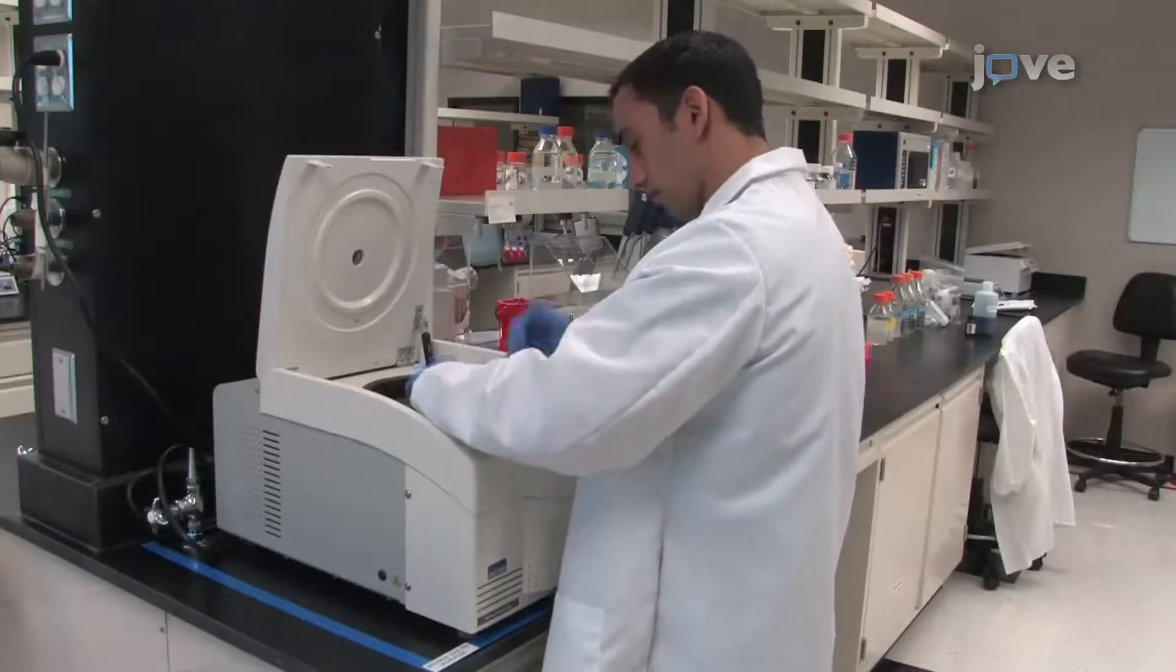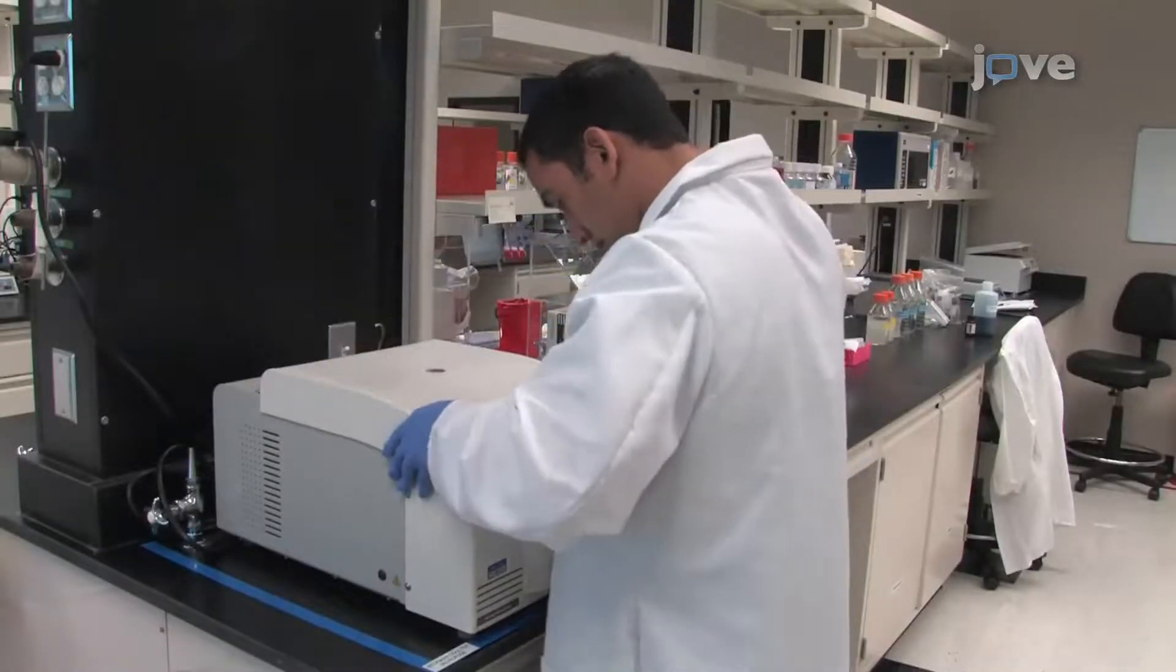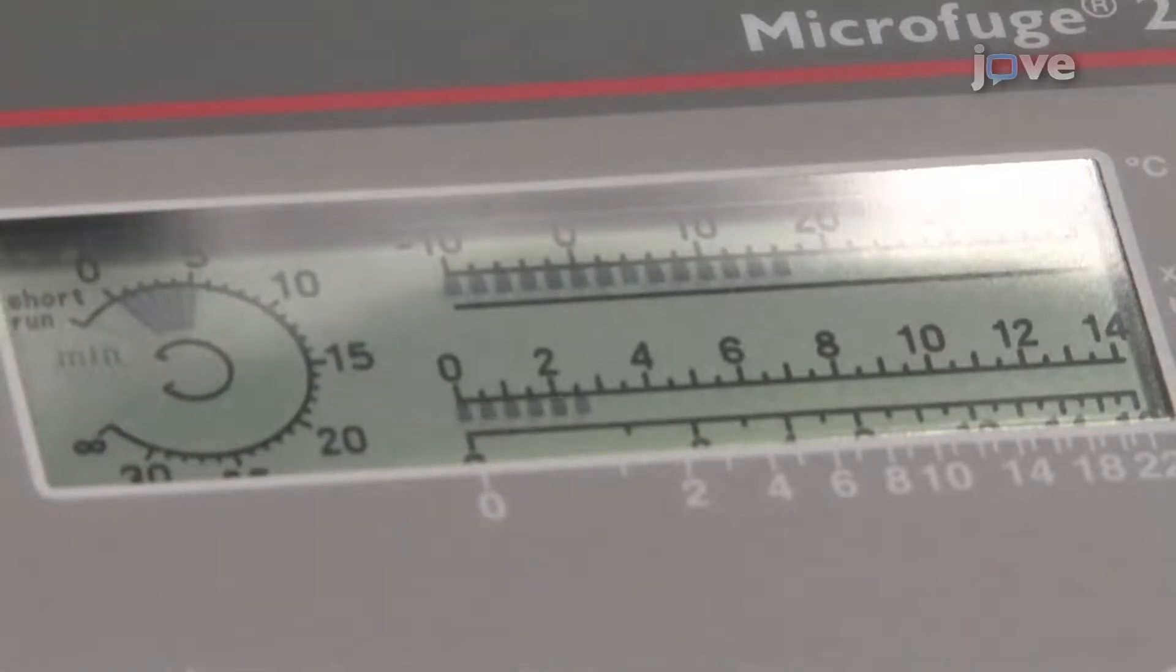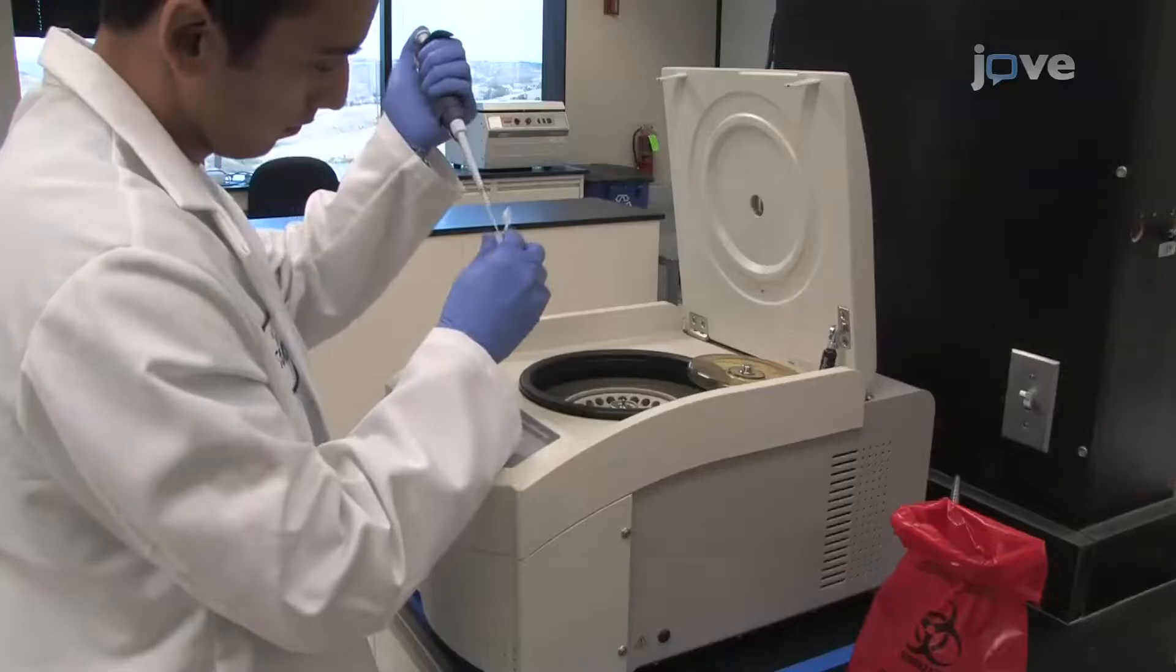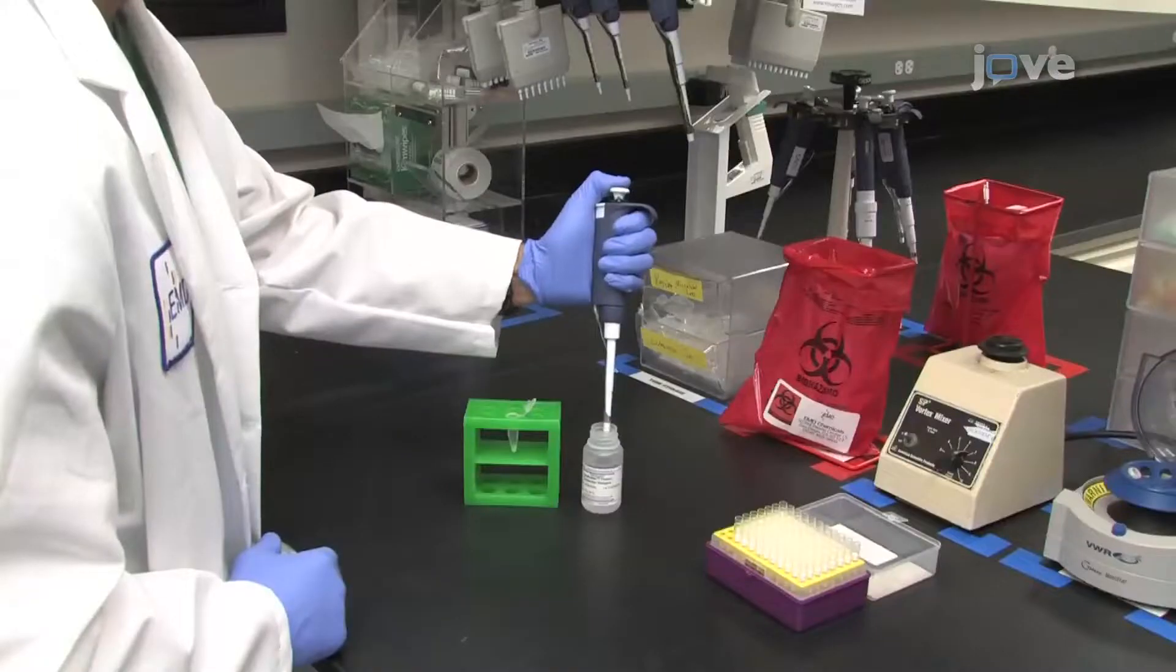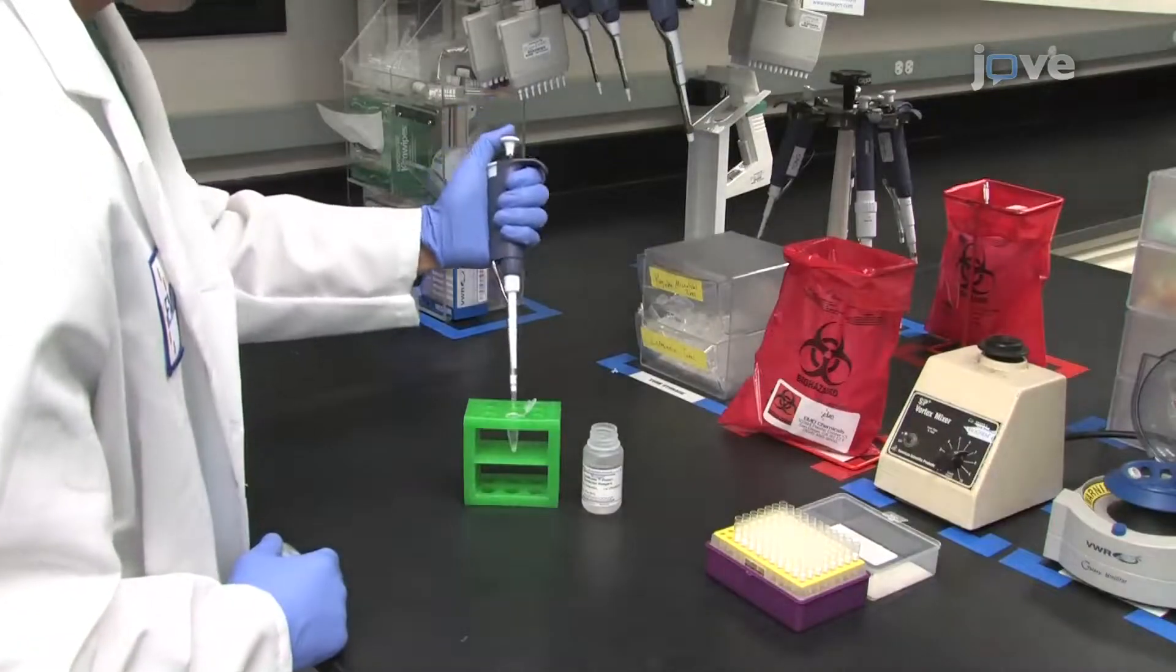The first step in Western blotting is sample preparation. Begin sample preparation by pelleting the cells using low-speed centrifugation, such as five minutes at 2500 times gravity. Following centrifugation, drain the cell pellets well. Resuspend the cells in CytoBuster Protein Extraction Reagent using 150 microliters per 10 to the 6 cells.